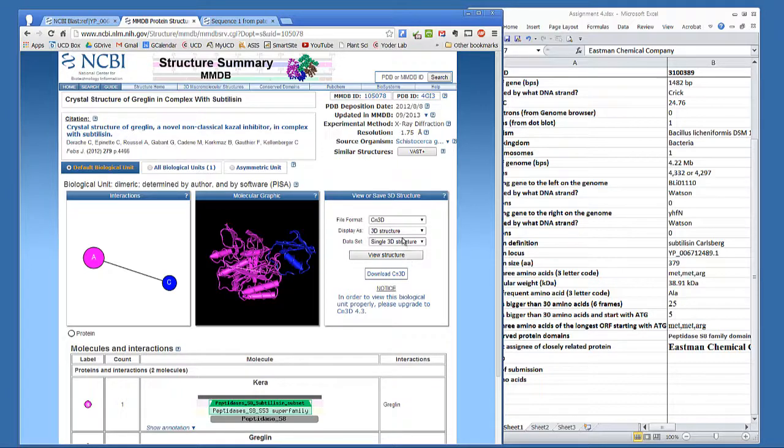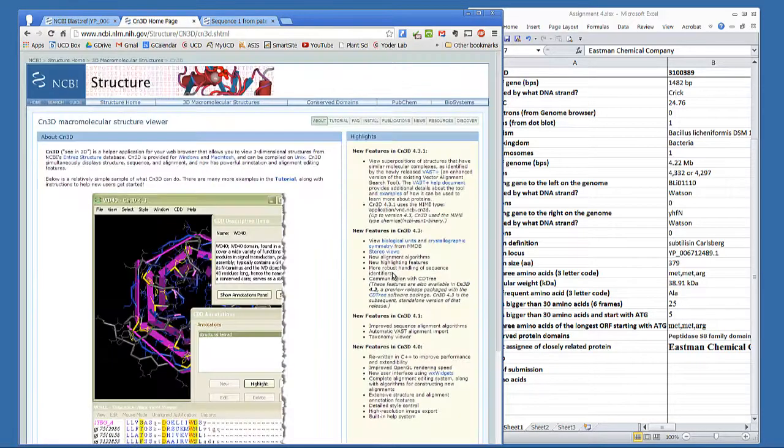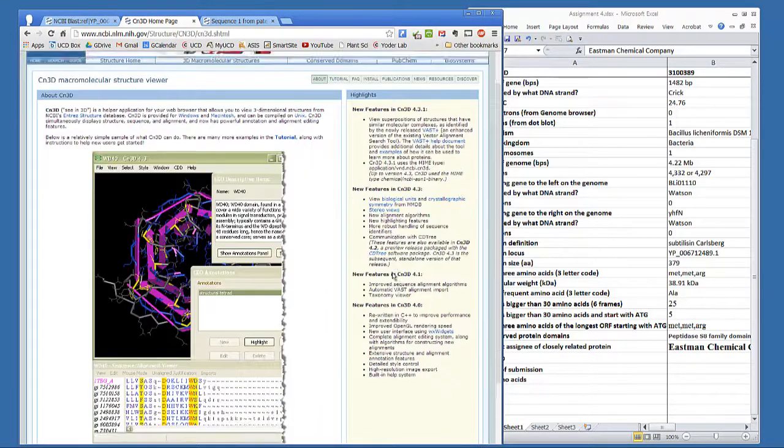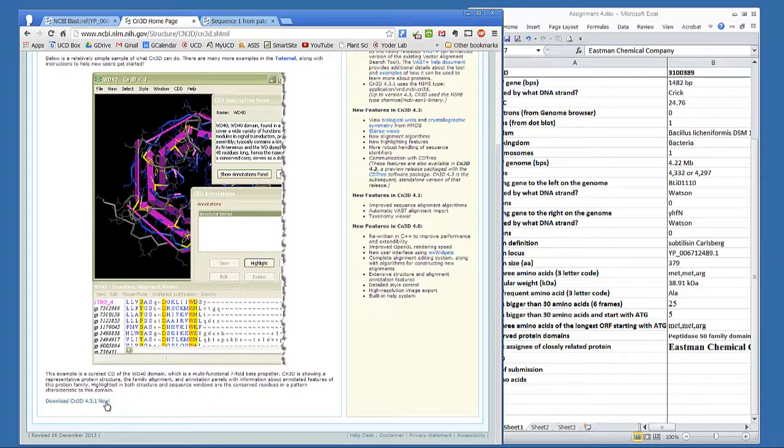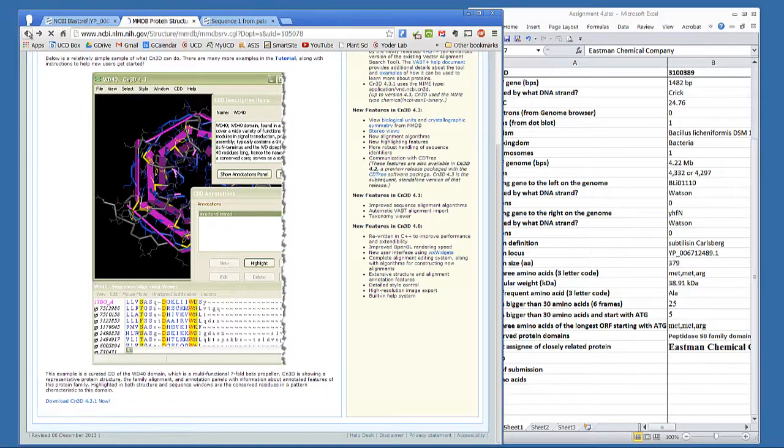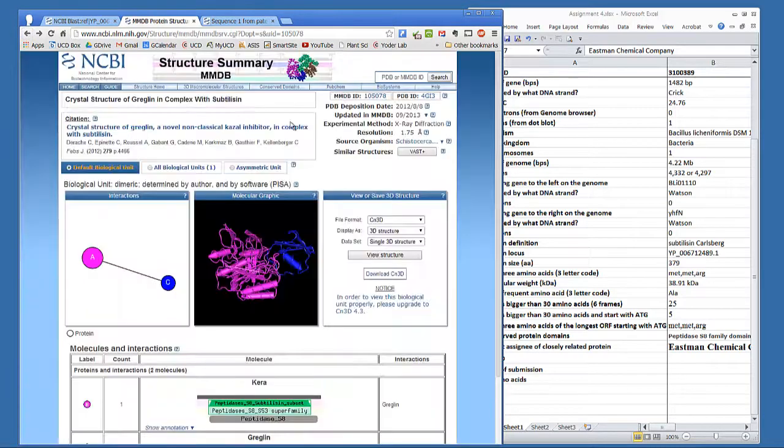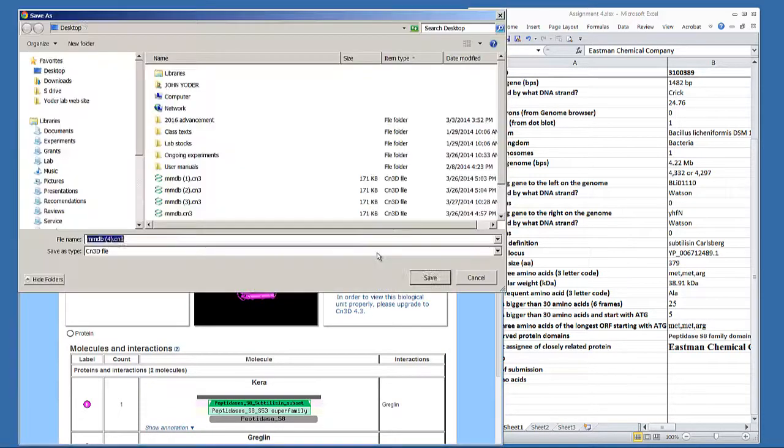Now to complete this assignment, you're going to need to download the CN3D program, so click on the download CN3D and install it onto your computer. Once you've done that, you can see the 3D view of this structure.